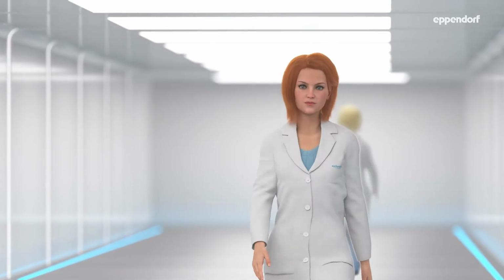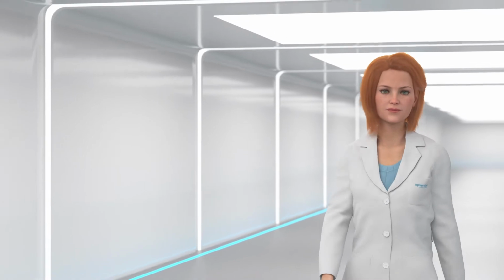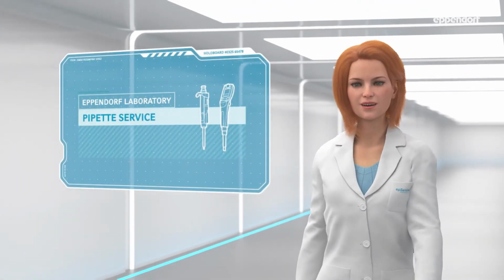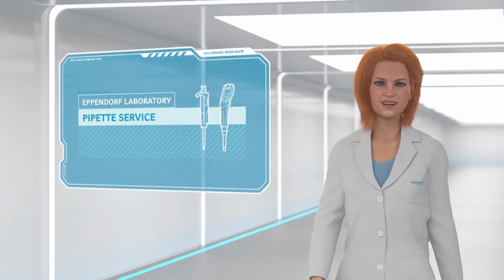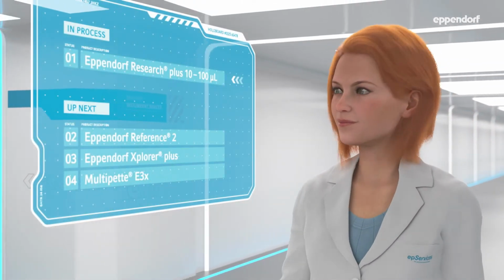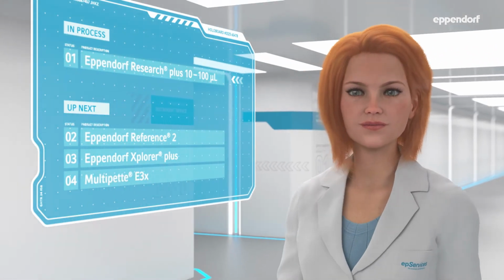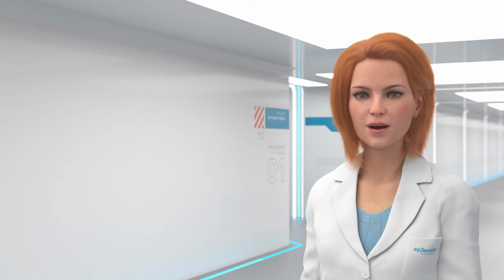Nice to meet you. Welcome to your personal guided tour through our service workshop. Come along with me. Today, you will gain deep insight into the various maintenance steps for your Eppendorf pipette. I see your pipette is being serviced. Let's watch how Tom is performing the maintenance procedure.